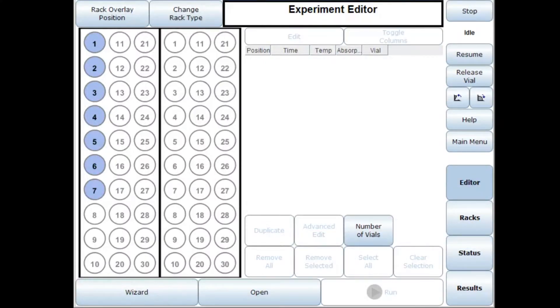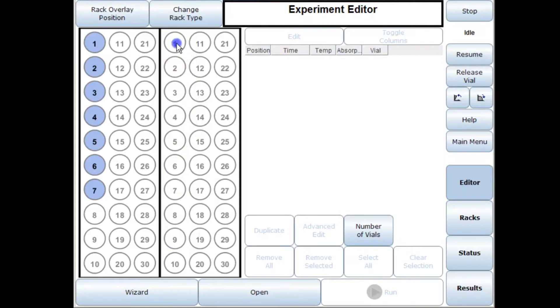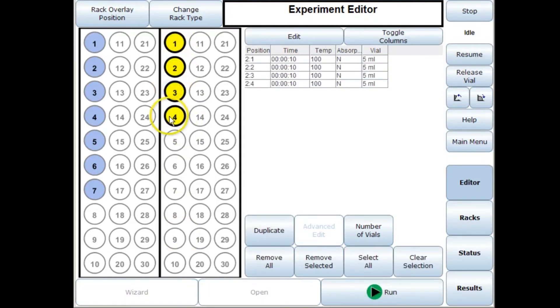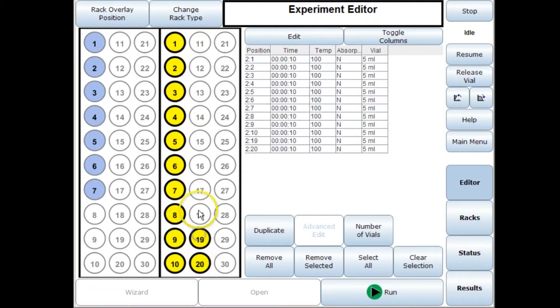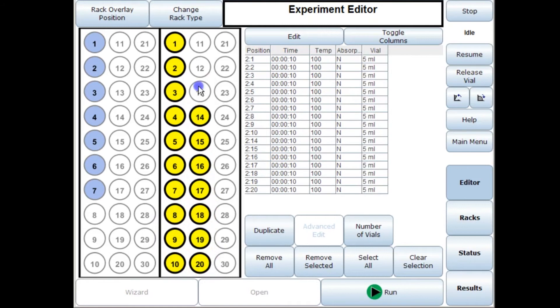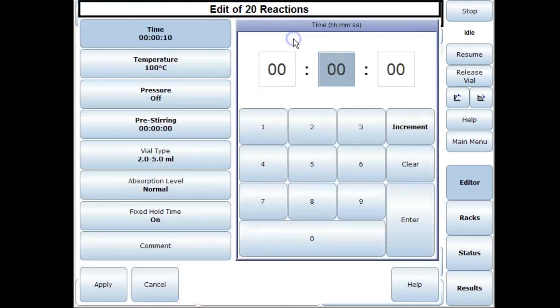Another example of where automation is useful is if you wanted to make a library of compounds. For example you might have 20 different Suzukis to do, you might have a number of different inputs but the reaction conditions might all be the same. In this case you could just select 20 vials, select edit, input your reaction conditions.